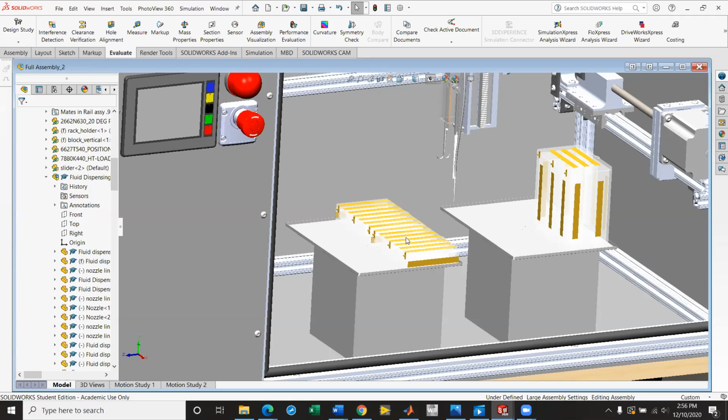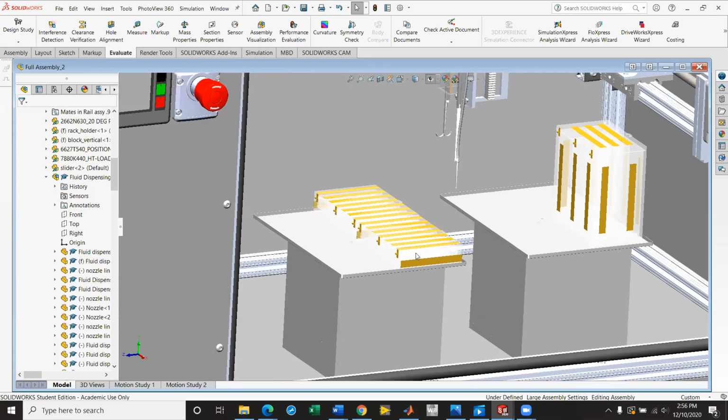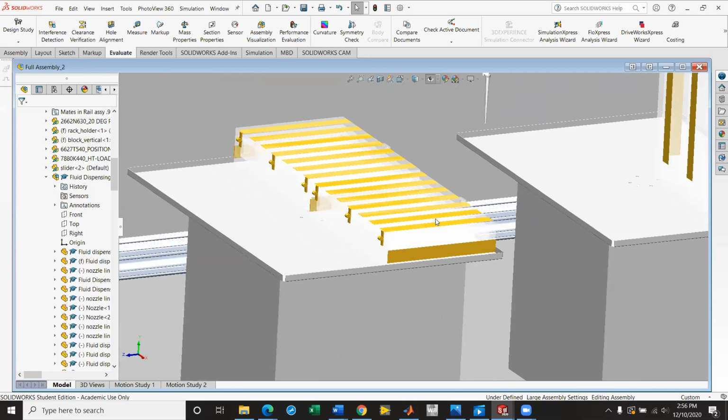So how are they sealed? The lids are just shut. What I was saying is the microplates are shut inside a much smaller compartment. And then the same gantry that has the liquid handler would open and close those? Yes, it has that hook.